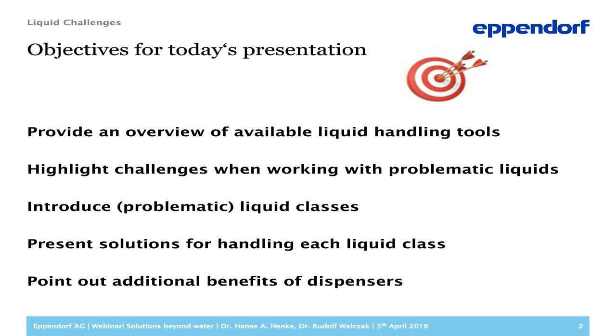So what are our objectives for today's presentation? We want to provide you with an overview of the different liquid handling instruments that you can be using in your work and show you some of the advantages and disadvantages. We want to highlight challenges that you may be facing in your work when working with problem liquids.